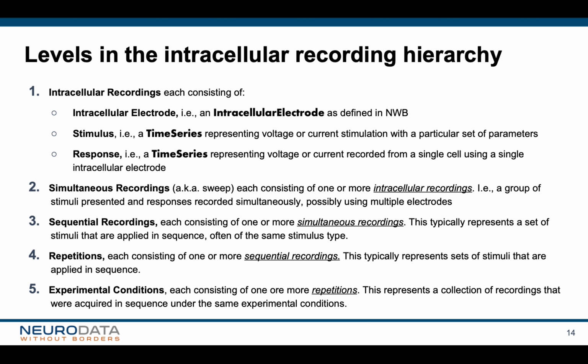So first, we will define the levels of the intracellular recording hierarchy, which is driven by the temporal organization of experiments. As we define this terminology for these levels, a goal that we had was to define them explicitly and use descriptive terms to avoid collisions with more ambiguous terms such as sweep or sweep sequence, runs, and traces, which can have varying meaning in different recording systems, for example.